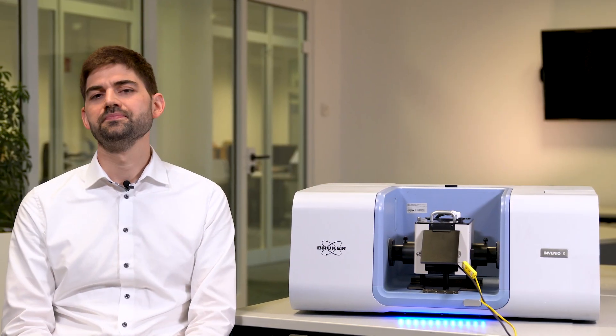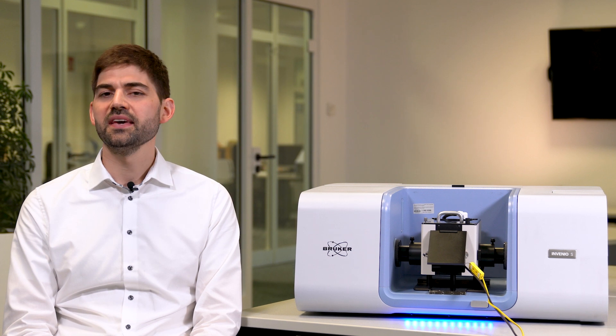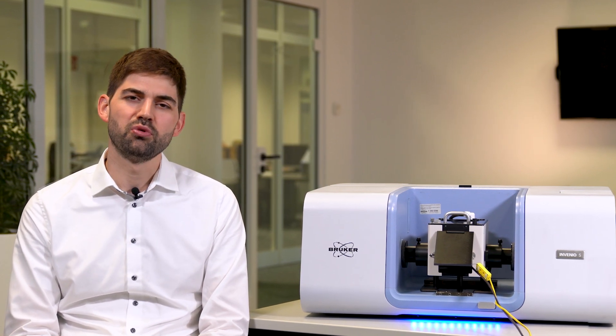Let me sum up here. DRIFTS can be used in applications such as chemical reaction monitoring in heterogeneous catalysis or photo-induced reactions. High sensitivity and signal-to-noise ratio are especially important for DRIFTS because the IR signals are very small. Invenio offers the performance for DRIFTS applications and can be adapted perfectly to your reaction by utilizing RapidScan, dedicated detectors or trigger functionalities.